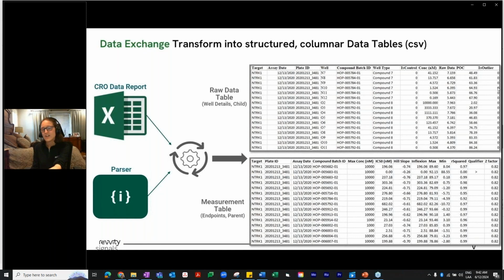These aren't reports that we've specified, but rather every time a CRO sends back a plasma binding assay or a PK study, they tend to come back in these same forms that have slight human variations that the tool handles, such as the table's been moved, or there's maybe a new comment line inserted or some coloration. But they tend to be fairly stable formats. And so we have a robust library for covering these reports. Each report is stored with a set of parsing instructions that can be sent to the engine and extract out the combination of the metadata, the raw data, and then analyze endpoints in an automatic fashion.